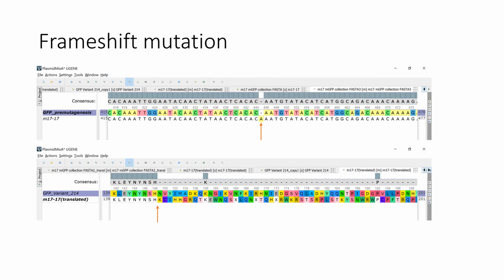So in your analysis of your mutant, it is possible that you might have a frame shift. This happens to be a little more tricky to analyze than a point mutation or a silent mutation. So what you're going to want to look for is a dash. There are 2 possibilities. You could have a deletion in your mutated sequence, or you could have an insertion. Here we actually see the insertion of an A. Whether it's a deletion or an insertion, it doesn't really matter. It's going to throw your reading frame off.